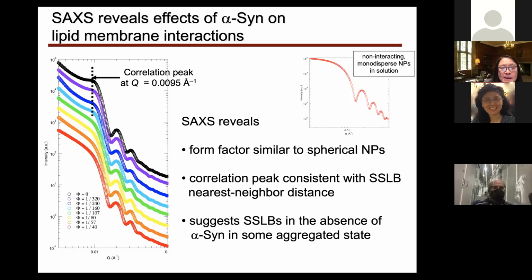However, this happens when you have no protein present, which is the black curve, and with low protein concentration as you go down. But as you reach a certain protein level, you actually see the disappearance of this peak. You can also see that this correlation peak is ameliorated as you start adding protein into the system, up to a point that it just completely disappears.